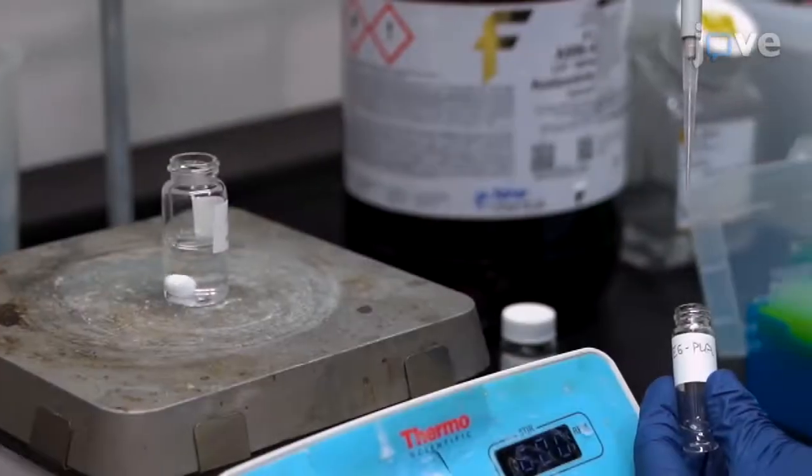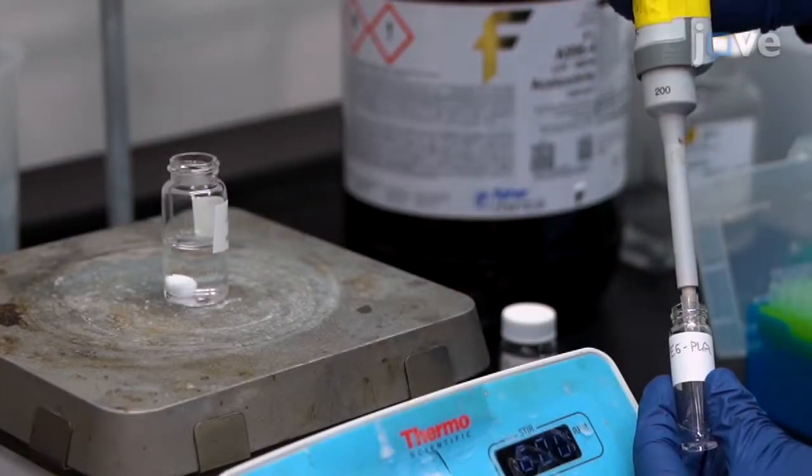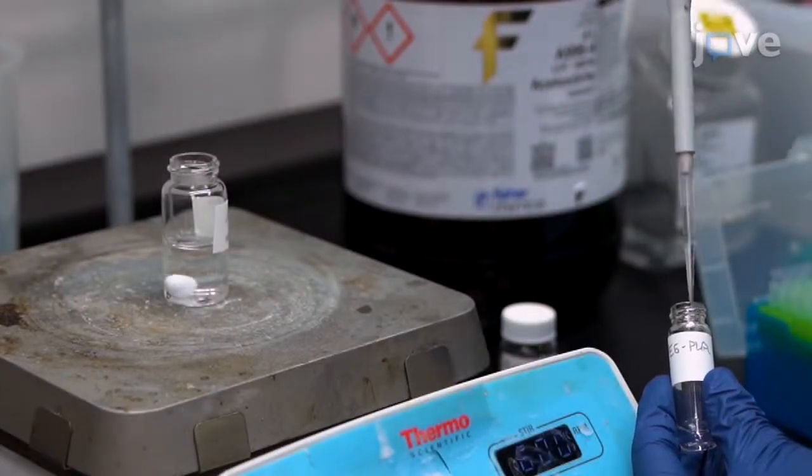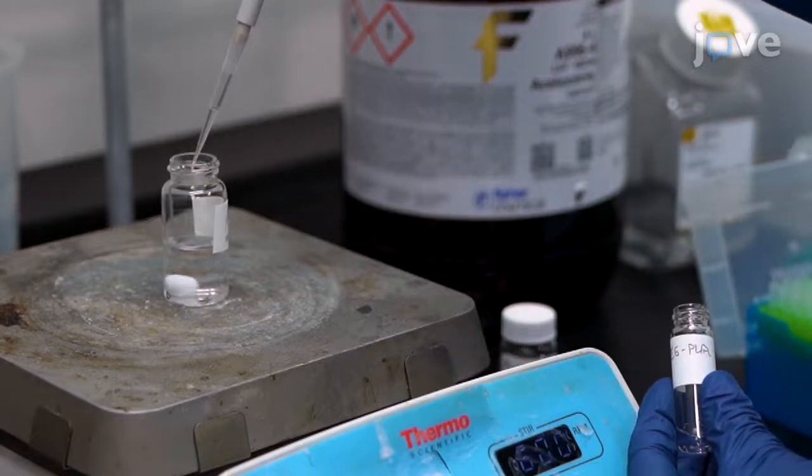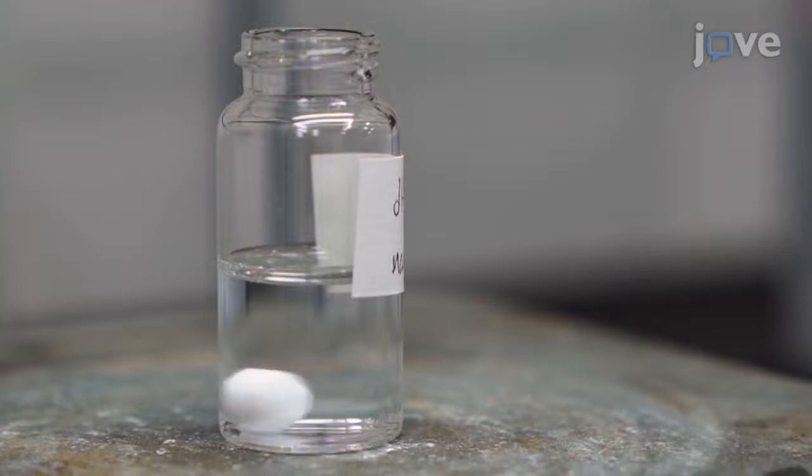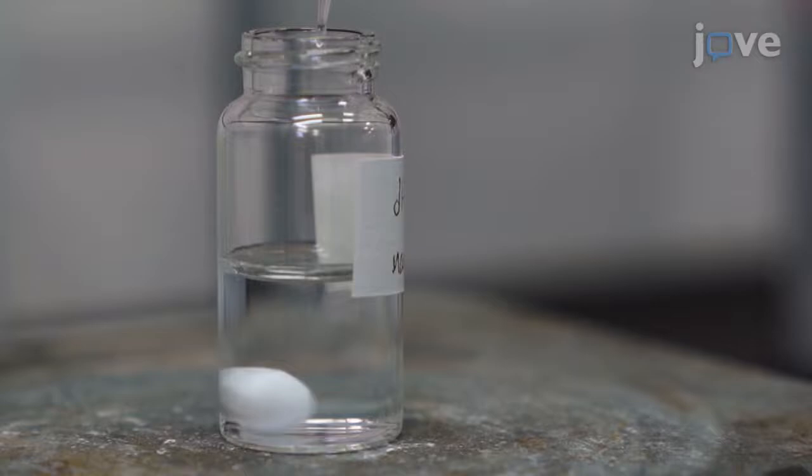Use a 200 µL pipette to add 1 mL of the polymer solvent solution dropwise to the vial of water. Core-shell nanoparticles will form as the polymer solvent solution is rapidly dispersed throughout the water.